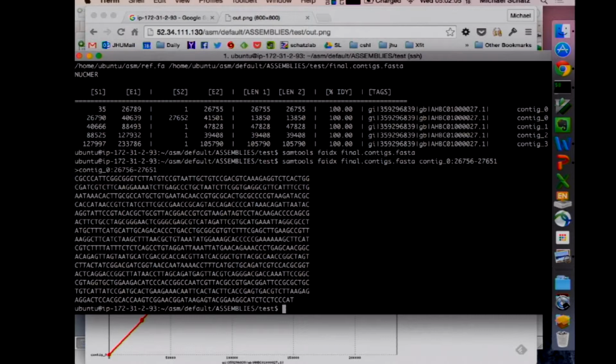Nothing too exciting here except that this DNA doesn't occur in the reference. So, okay, the last step now is just to run it through our decoder. So we can just pipe that into our decoder. Oops. Let me make this a little bigger so everybody can see what I'm going to do.